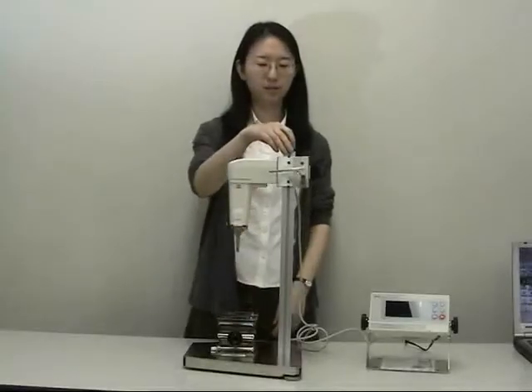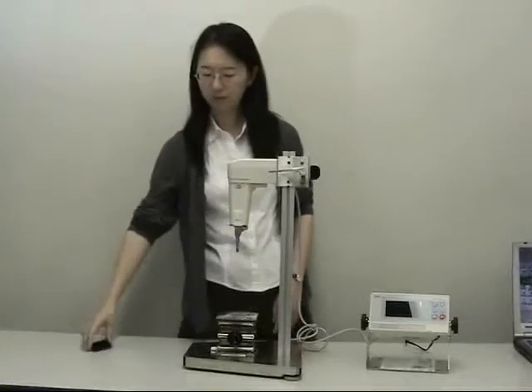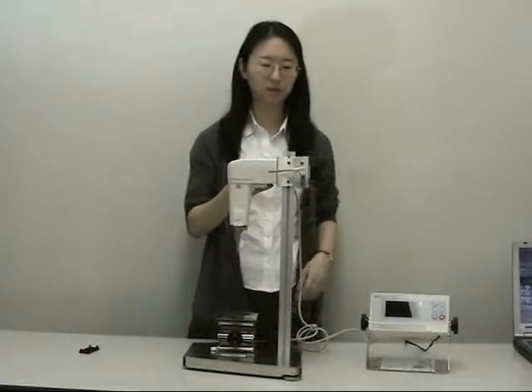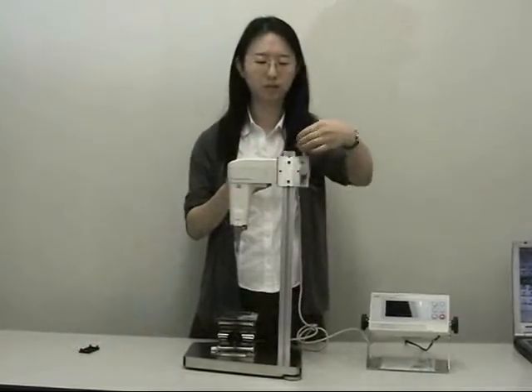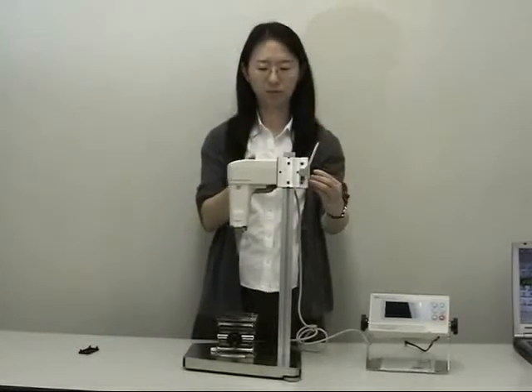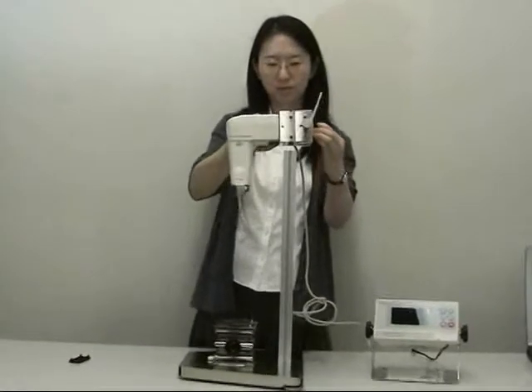The position of the sensor unit can be fitted to face the opposite direction on the stand, for applications involving bigger sample containers or in the process of viscosity measurement.